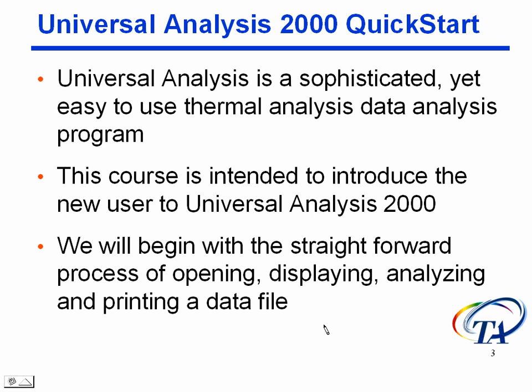Okay. As I mentioned, this course is intended to introduce the new user to Universal Analysis. I'm talking brand new user here, somebody who's barely even turned on the program. For people with experience with Universal Analysis, there's a series of additional courses that we're developing. One has already been introduced. It's called Universal Analysis Part 1. That course basically picks up where this one left off and gets into a lot more detail about a lot of these subjects. There'll be a subsequent advanced course on Universal Analysis to be released sometime in the future. You can look to our website for when it will be released.